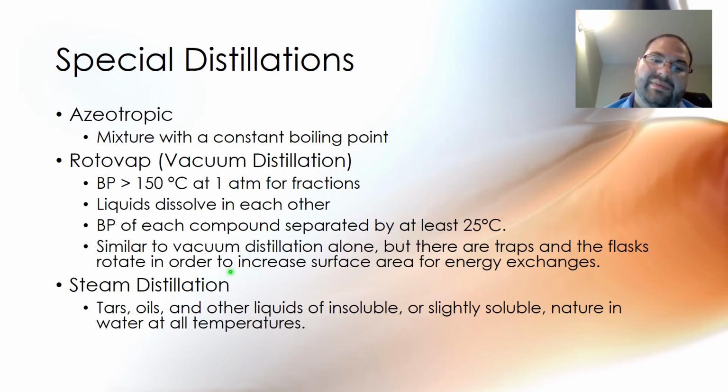And then you put them in a giant steam column. It's pretty big if you're going to do that much, use that much mass in it to make actual products with it. But you can do a small setup with quite a bit of material. And this was actually done over the summer with a K-12 outreach project that chemical engineering was doing with Dr. Stretz, I believe it was. She had the female high school students doing orange oil distillations with water setup.